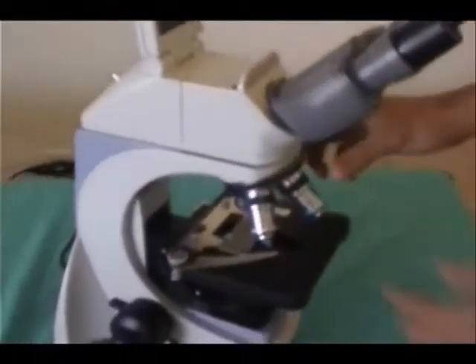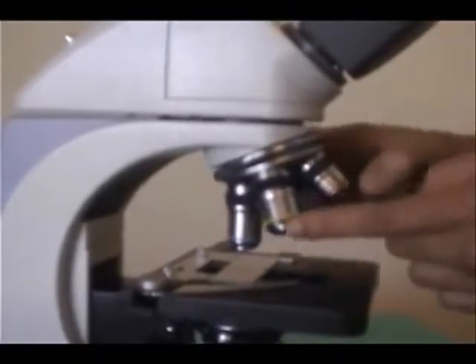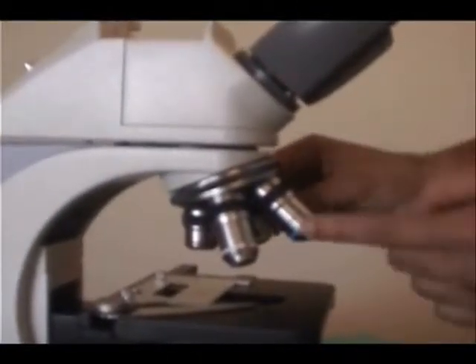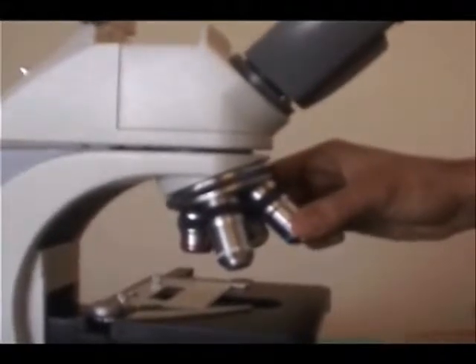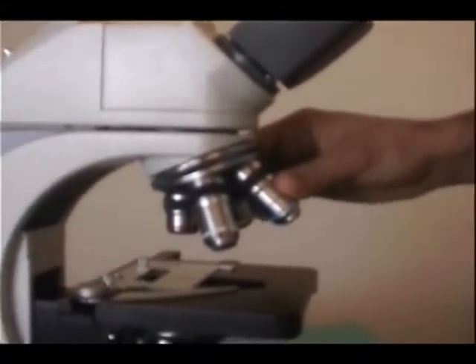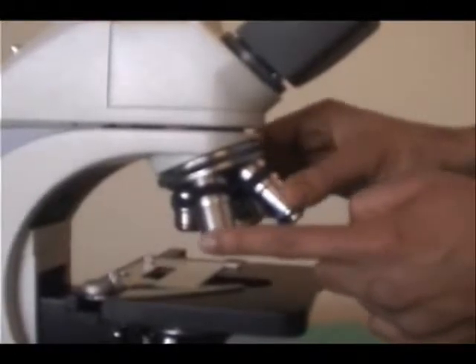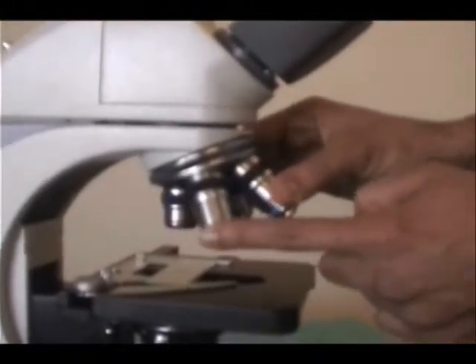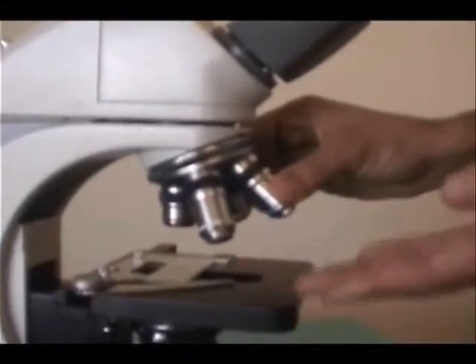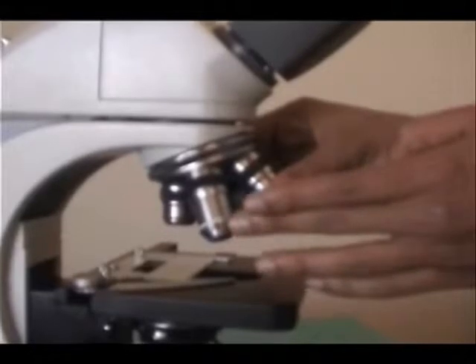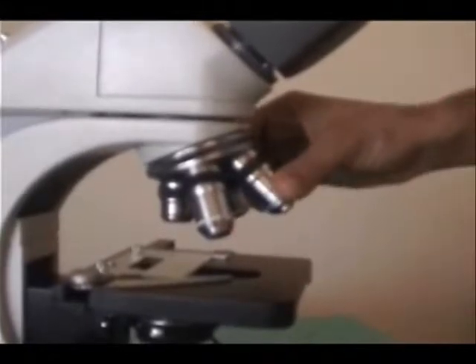Next, what we have here are the objective lenses and they start at 4x, 10x, 40x all the way up to 100x. As you can see, they smoothly transition from objective to objective and when they lock into place, they're very steadfast. So you're not going to get the problems you see with less quality microscopes where it'll be in between or they'll start switching from one objective to the other slightly.